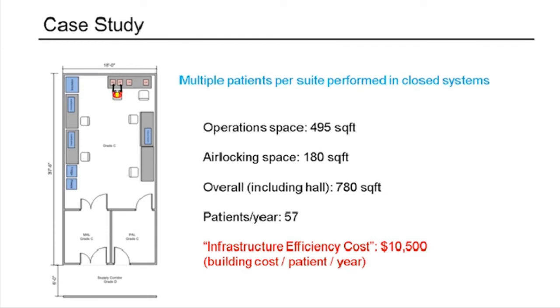And the operational space itself has a much smaller footprint, since the closed systems typically have onboard analytical devices, they don't require quite as much additional equipment to support, so the space itself can get smaller to accommodate those operations. And then because the room air quality is declassified a little bit, there's fewer airlocks required to gown into that space.